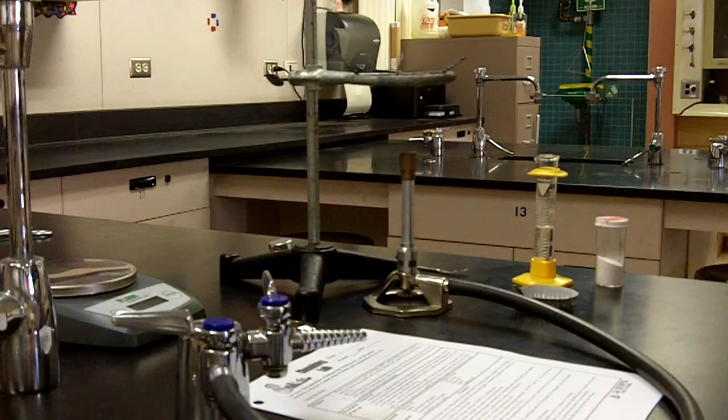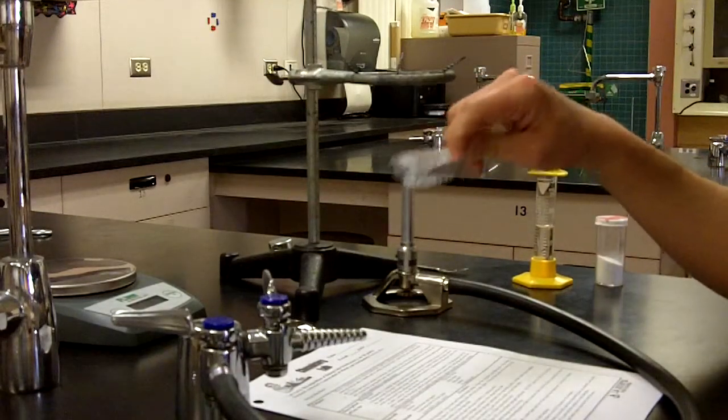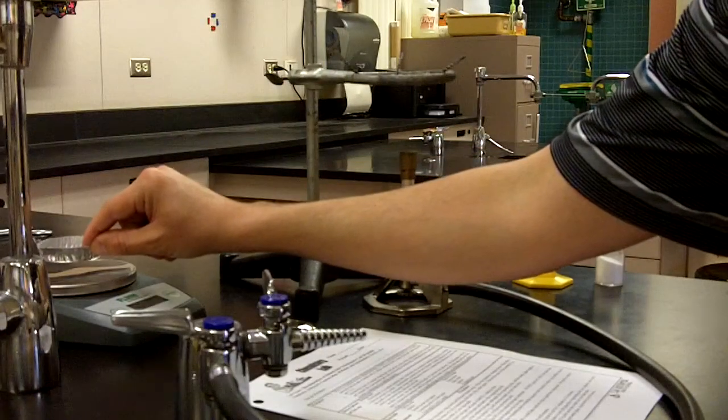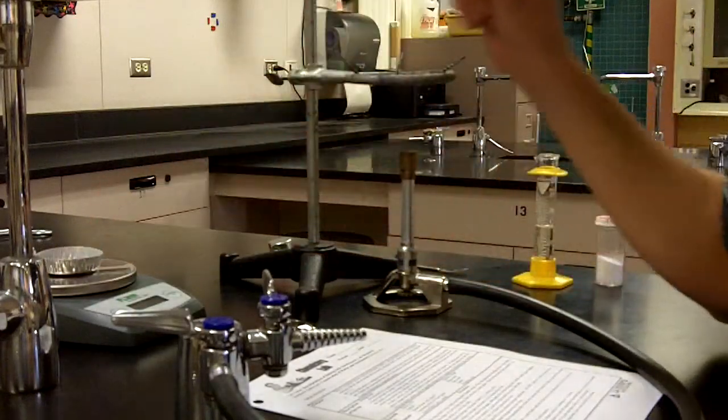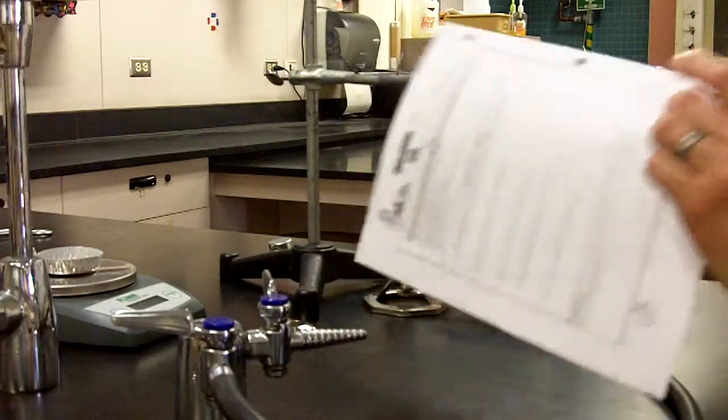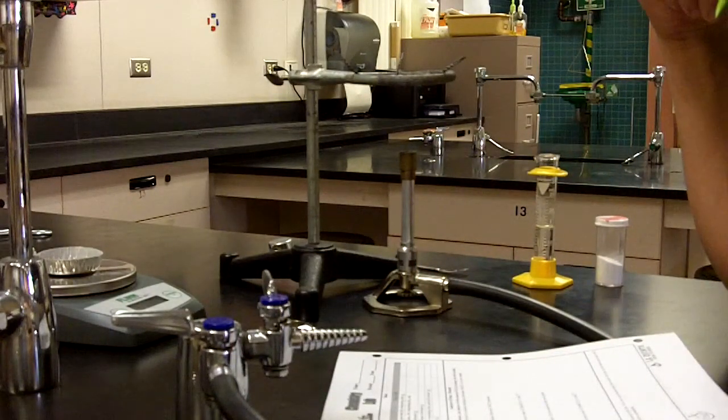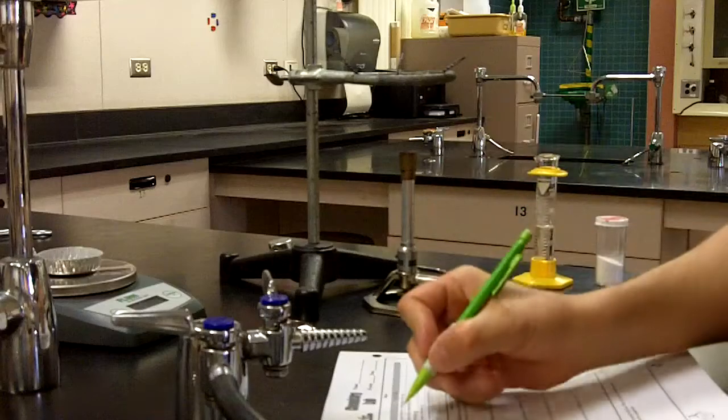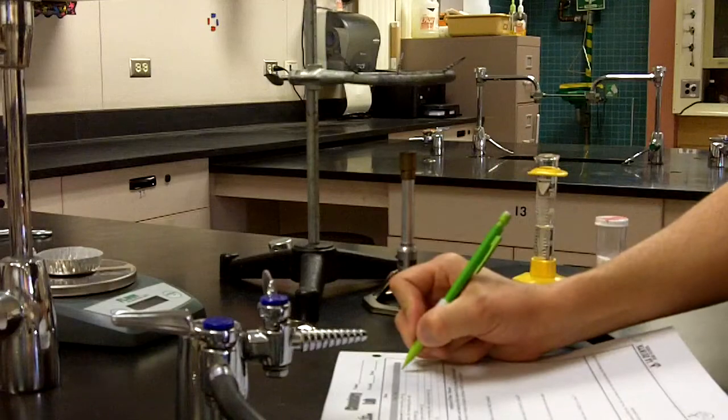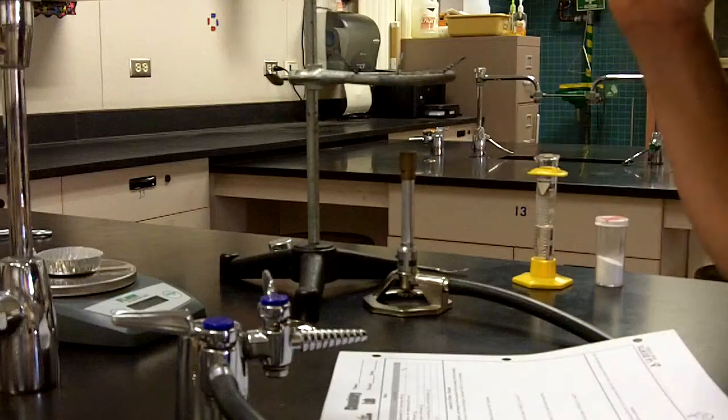We're just going to follow through with the procedure. First, we need to obtain the mass of the aluminum foil evaporating dish prior to getting the reactants in it. So I place it on the electronic balance that's been zeroed. The mass that I want to record is 1.4 grams. Turning the paper to the second side where it says mass of dry evaporating dish, we record 1.4 grams.